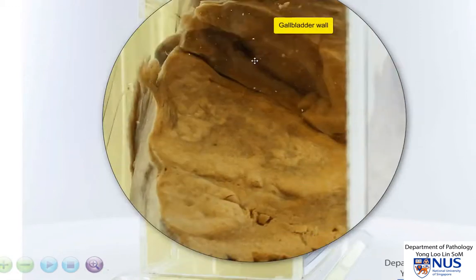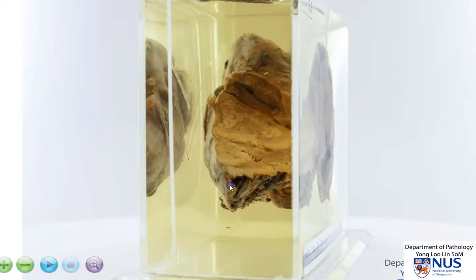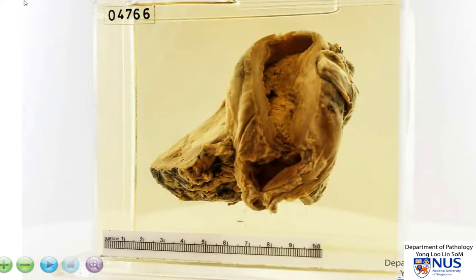this is the gallbladder wall. This is the cut surface of the liver that is adherent to the gallbladder. These whitish, ill-defined areas are actually tumor extending from the gallbladder into the liver parenchyma. And this is the resection margin of the liver. So clearly we can see that this tumor is extending beyond the gallbladder into the liver, and this is probably the reason why they resected the liver together with the gallbladder.